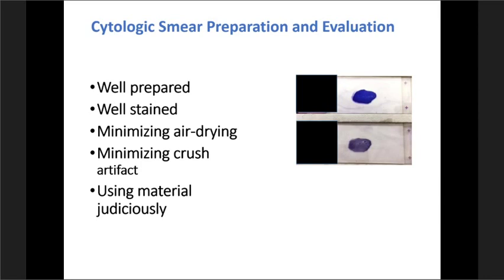for each episode or pass that is done for the aspirate, we prepare 2 slides. One is air dried, and that would be a Diff-Quik stain on site, and the other slide is put in alcohol for subsequent staining with the Papanicolaou stain. So you take a look at these 2 examples here, and you see how the smears are done. They have almost like a head, body, and tail going on, and a nice way of preparing them is basically to regulate your output here. If you have only about 2 drops, which you place in the upper 1/3 of the slide next to the label, and then gently smear it, this should give you the result.